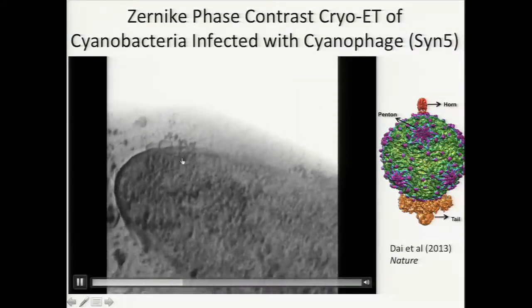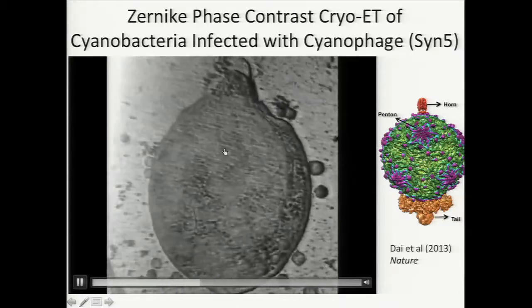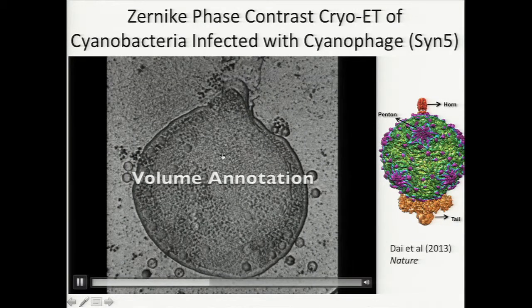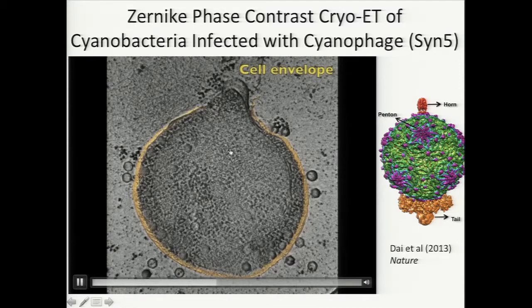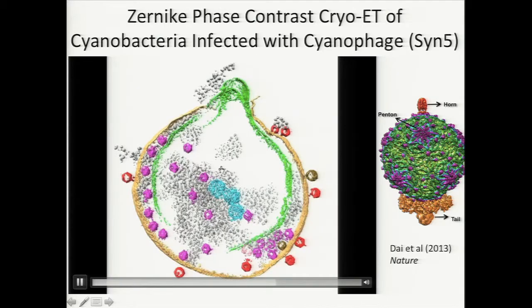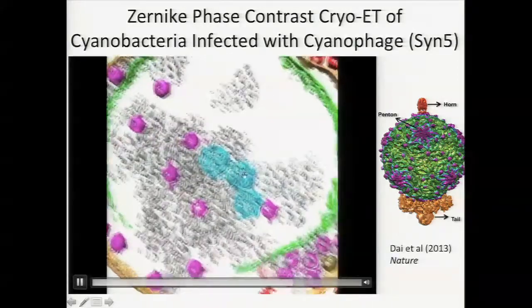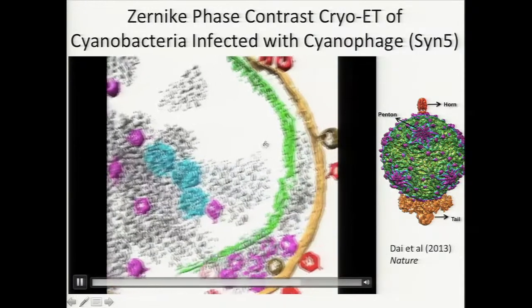I do a volume rendering to show different aspects inside the cell. These are phages infecting the cell, and looking at different angles and side views, one of the most time-consuming aspects is annotating the features in the cell. The cell envelope is shown in orange; in green is what we call thylakoid because this is a photosynthetic bacterium. There are also carboxysomes, lots of ribosomes, vesicles, infecting phage particles at the perimeters, expanded phage particles inside, and many other particles in purple inside — resulting in a completely annotated tomogram.